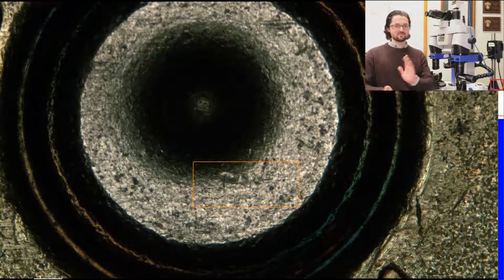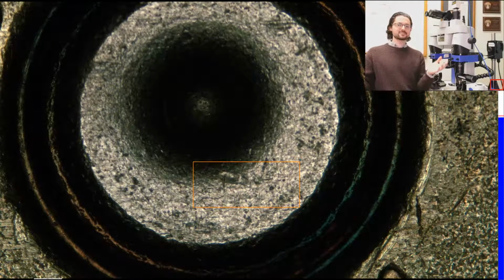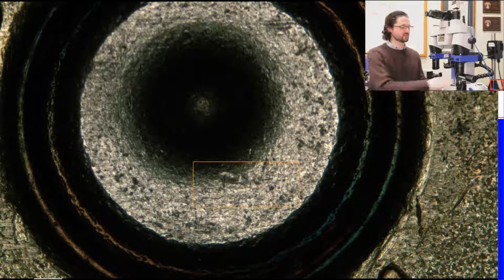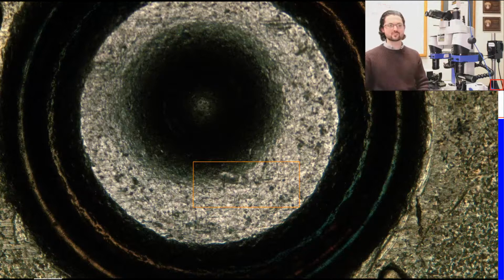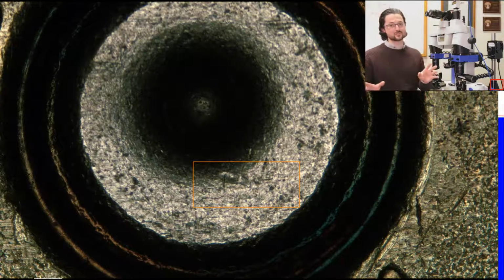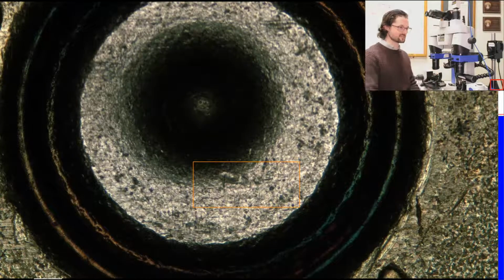All right, so now let's get to the nitty-gritty. How do you put this thing on and how do you take it off? Because as you saw when I switched over to fluorescent, it does steal a lot of light for your traditional fluorescent or fiber optic imaging. So this is really cool, and a lot of work went into this, so I hope you guys like it.